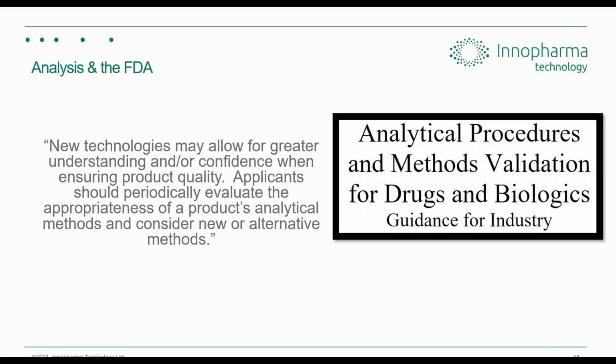So there's just a statement here talking about really new technologies that's mentioned in this document. But essentially under alternative analytical procedures, the data that you generate could be used as part of an analytical method comparability study.